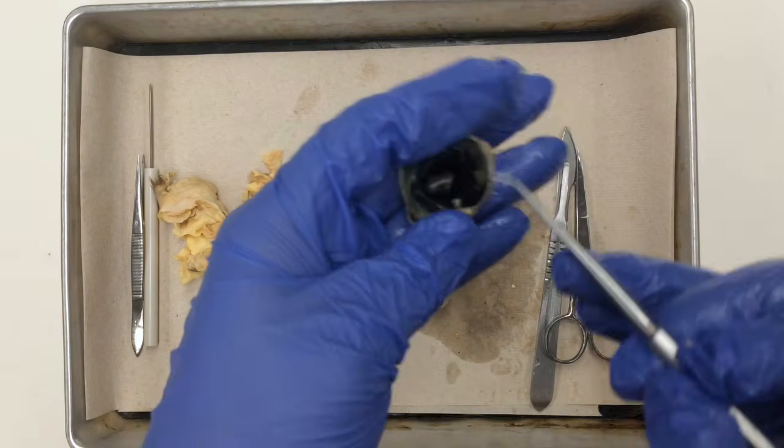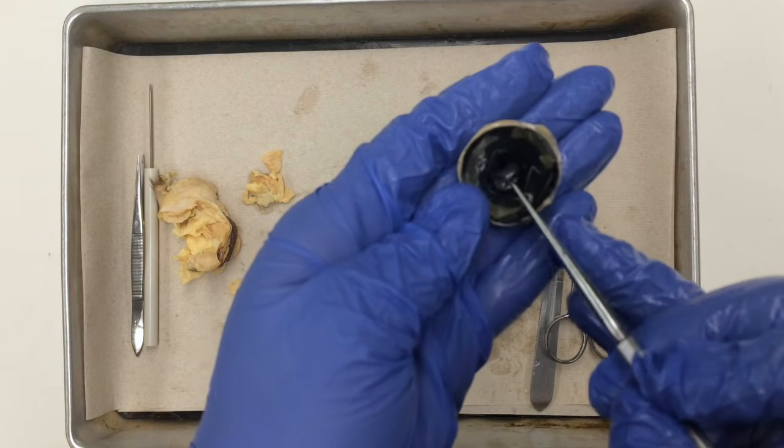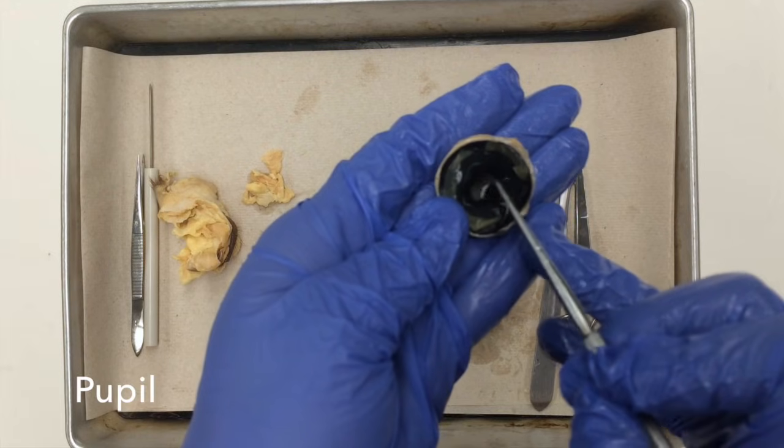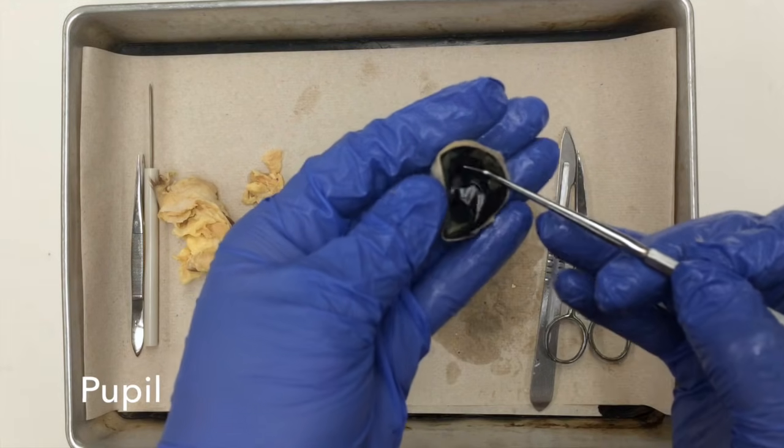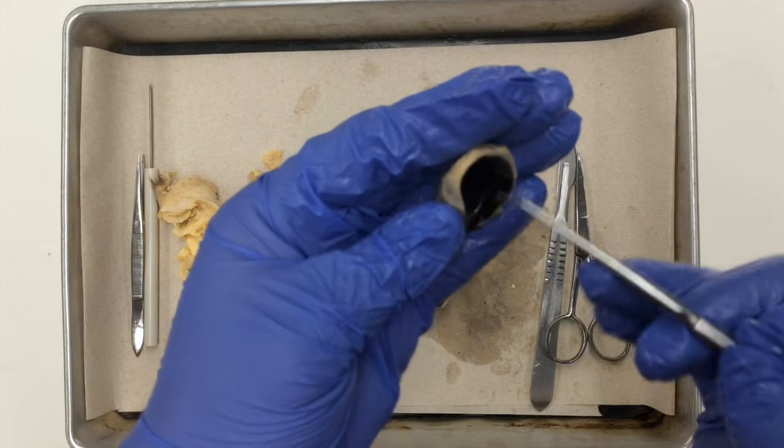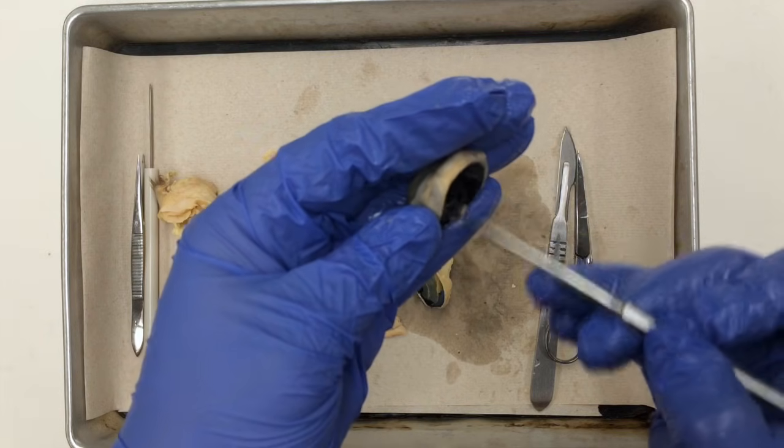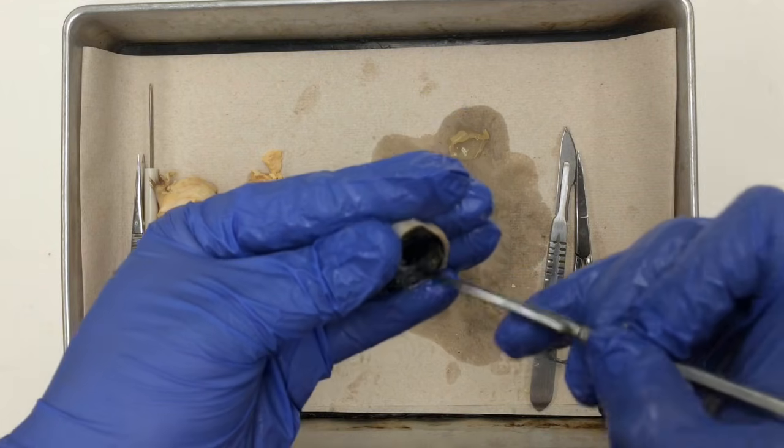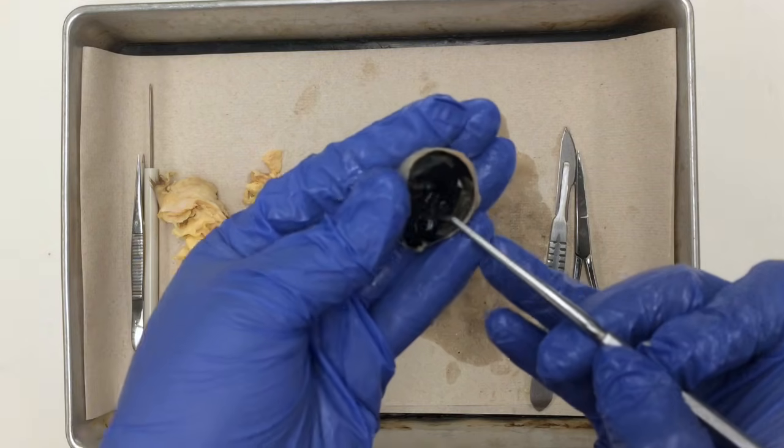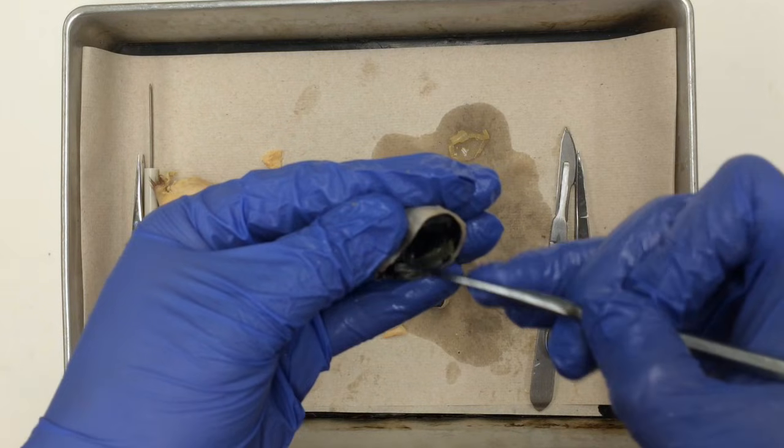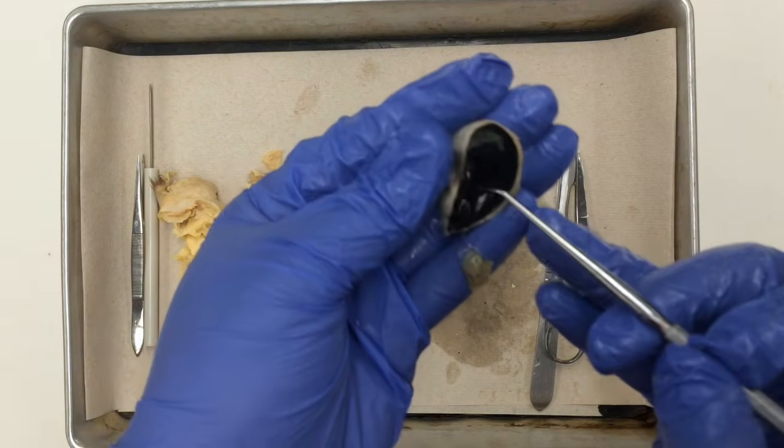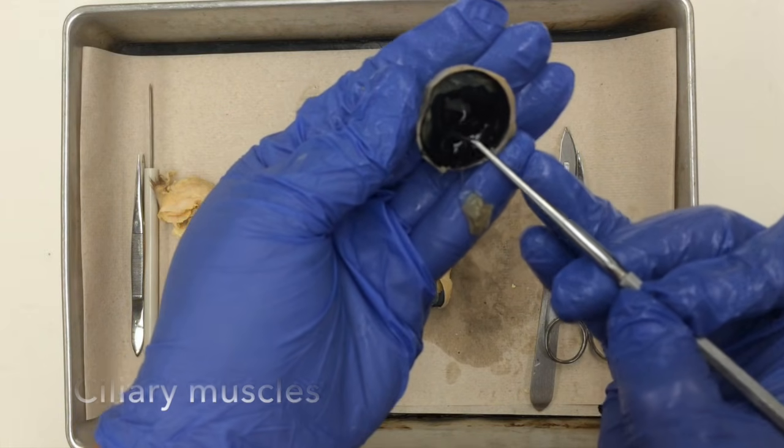If I look into the center of the eye, notice there's an opening known as the pupil. And if I scrape more of the vitreous humor off, I can actually see little structures right there that radiate behind the iris along with the eyeball, and these are all your ciliary muscles.